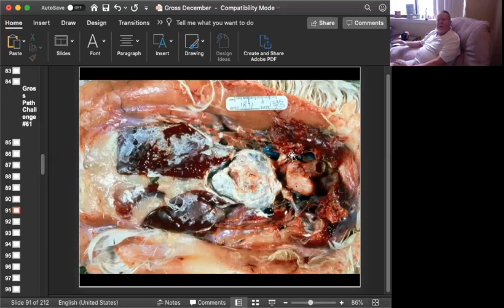The morphologic diagnosis, whenever we look at gout, okay, this is a granulomatous reaction. This is not fibrin. Sometimes you will see a lot of fibrin in cases of colibacillosis or gram-negative sepsis in birds, but this has a very different look. It is sort of white. It is sort of powdery. Very characteristically it is on the epicardium or the pericardium here, and it very characteristically does that. So we see the best lesions there. This one obviously is on the liver as well. It looks like there's some mycelium. This is sort of a fat bird too.